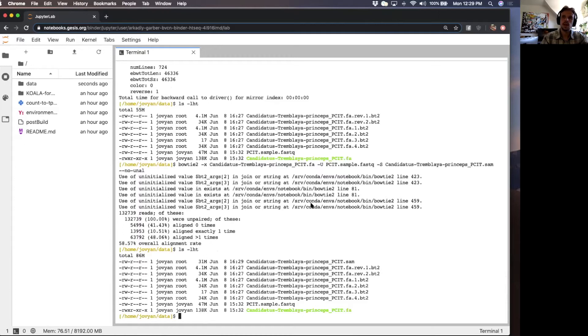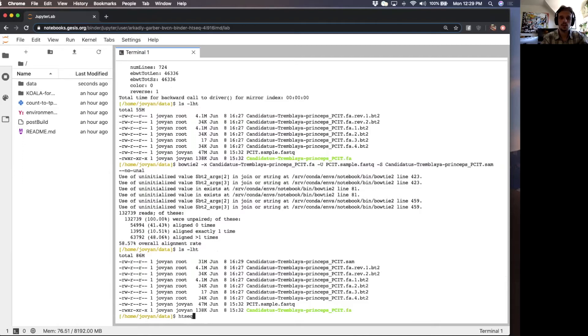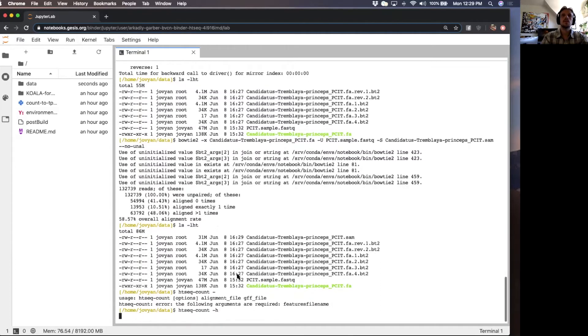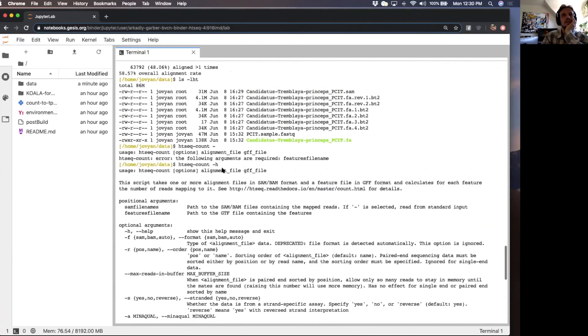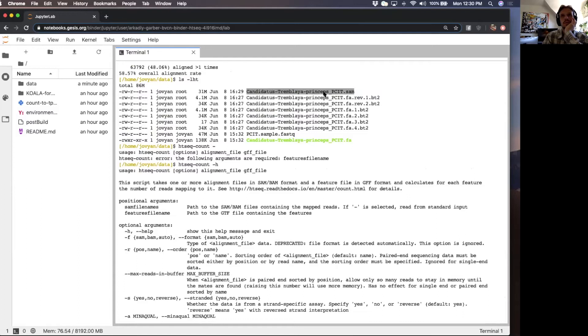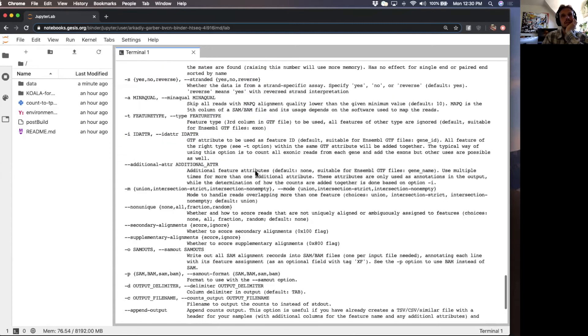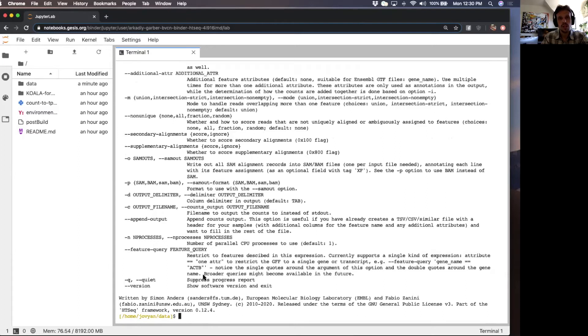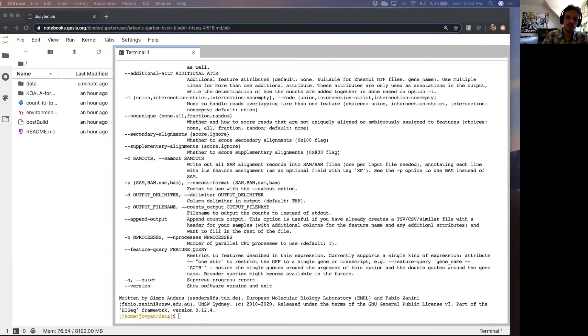We have one part of the equation. HTCount actually has two positional arguments that are necessary to have it running: an alignment file and a GFF file. We have one, an alignment file. So now we need a GFF file. I'm not going to discuss GFF files too much. I will mention that in the functional annotation lesson one, Ben Tully does talk about ORF prediction and using Prodigal and one of the outputs of Prodigal is a GFF file.